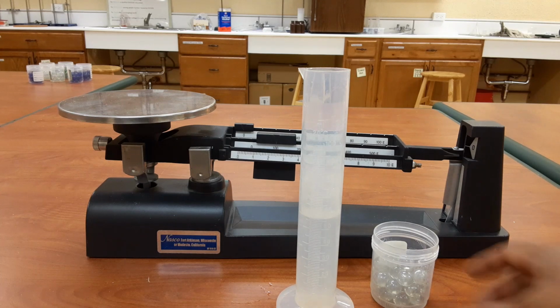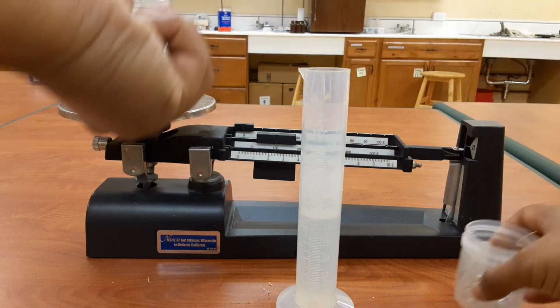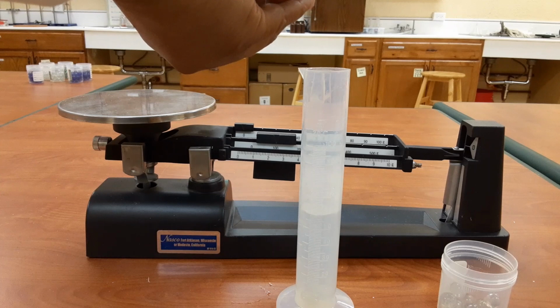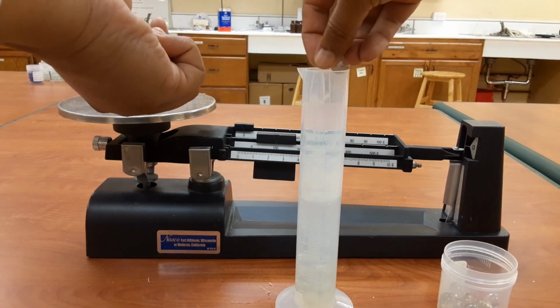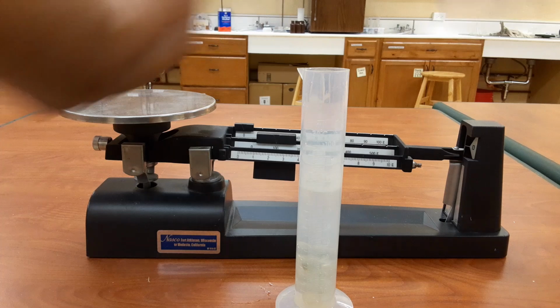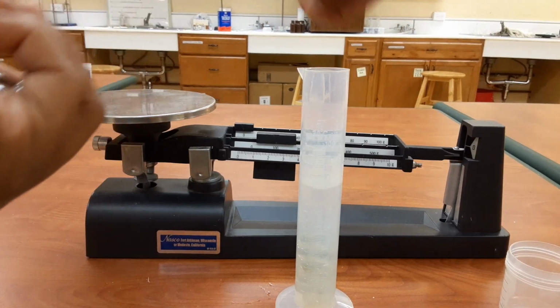So what I'm going to do next is put these marbles into the graduated cylinder very carefully, and you can notice that as these marbles go in, the level of the water is rising up. So this method of finding the volume of an object is called the displacement method.